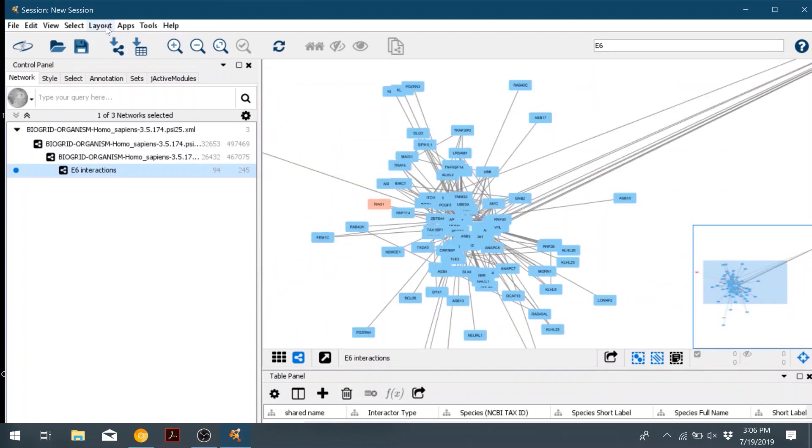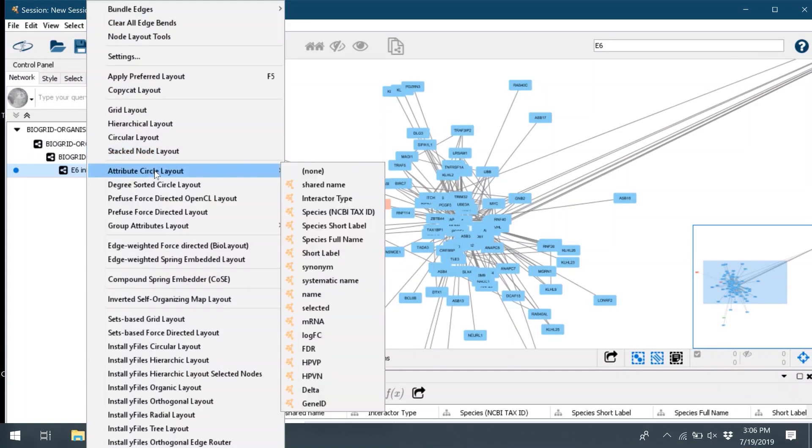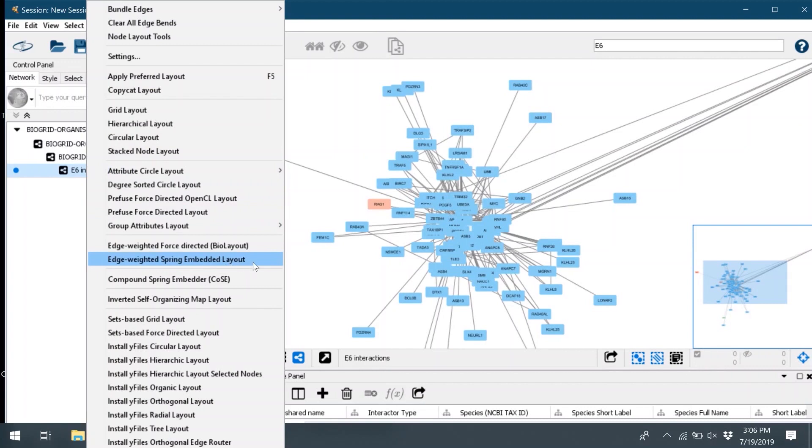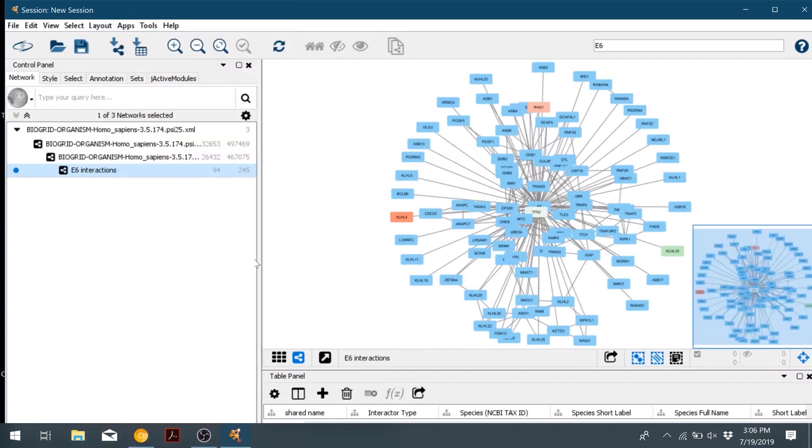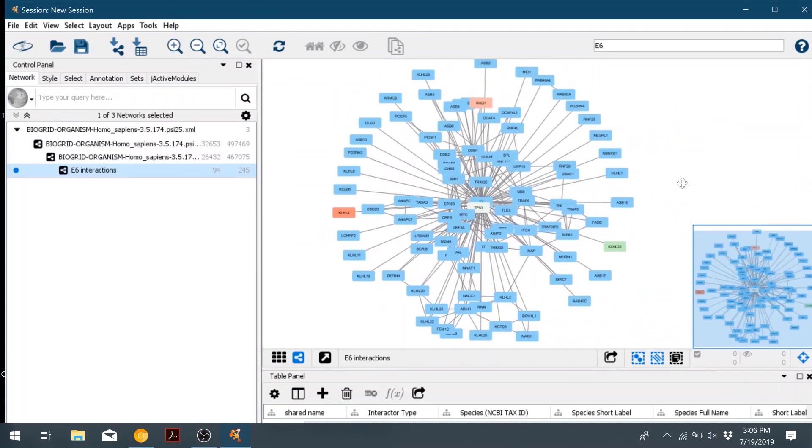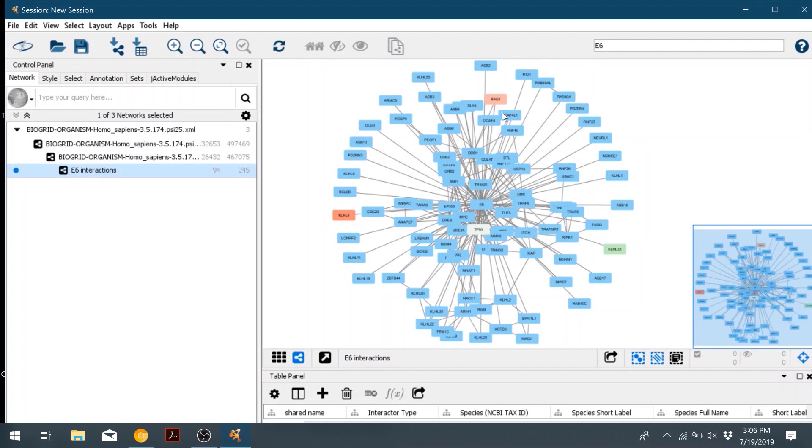So if we go to the layout tab in the top toolbar, and then there's tons of different layouts you can play around with depending on what your network looks like. I like the edge weighted spring layout, so we'll go ahead and click that one. And then it now makes this nice circular one with E6 basically at the center. There's one node overlapping, so I just clicked it and dragged it out of the way.